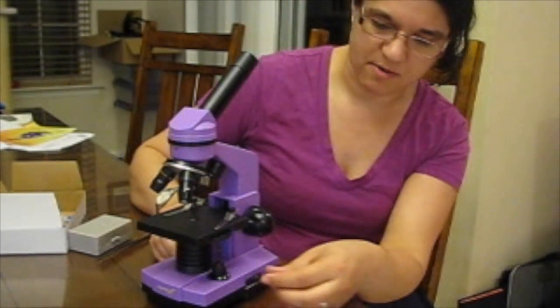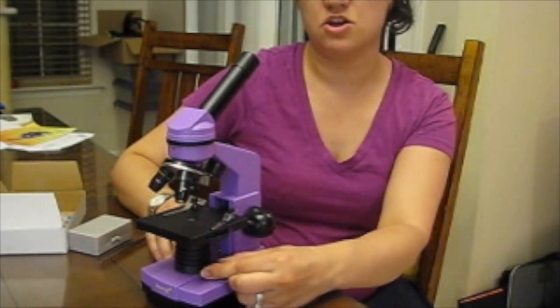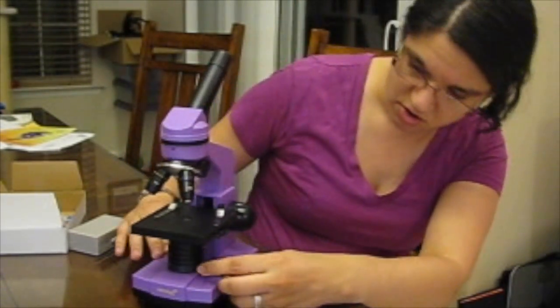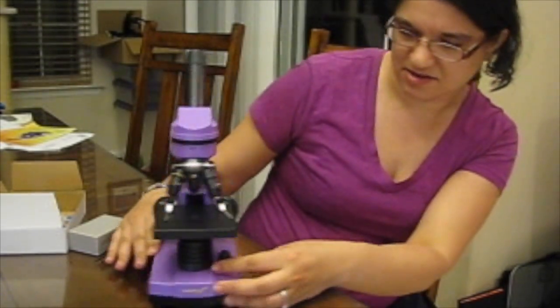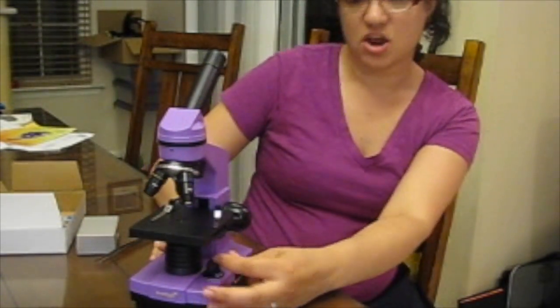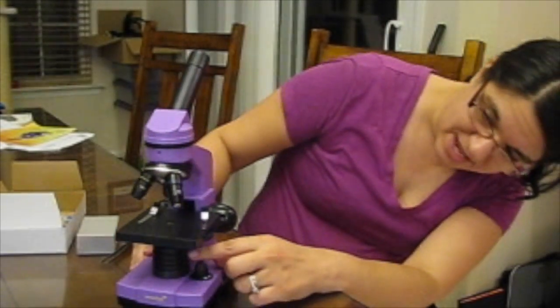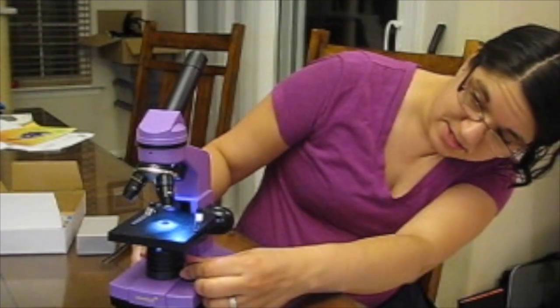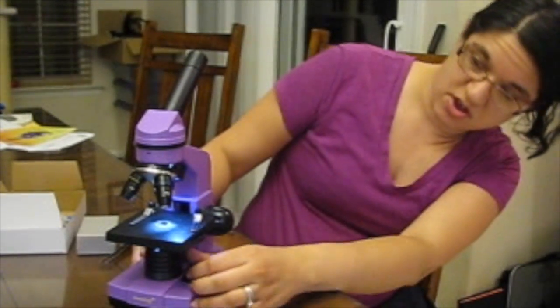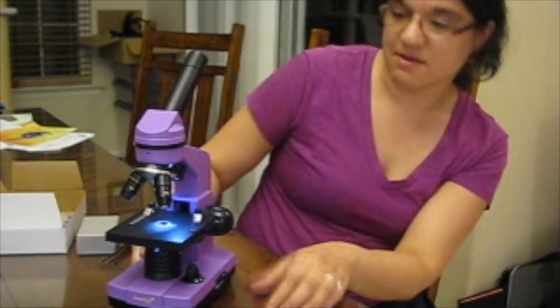So there's a knob right here. I just click it over once. Click it once and the bottom light turns on. Twice and the top light turns on. And three times and we now have both the bottom and top light.